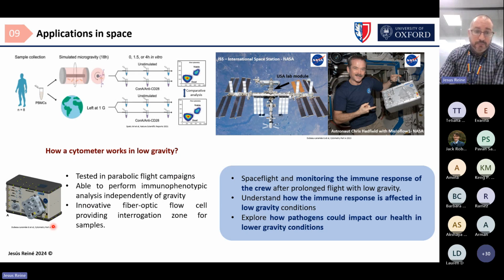They recreated a machine which is able to analyze the cells independently of the gravity, with a very innovative fiber optic able to interrogate the cells independently of gravity, which is really, really useful. Here you can see one of the astronauts, Chris Hadfield, with this instrument.